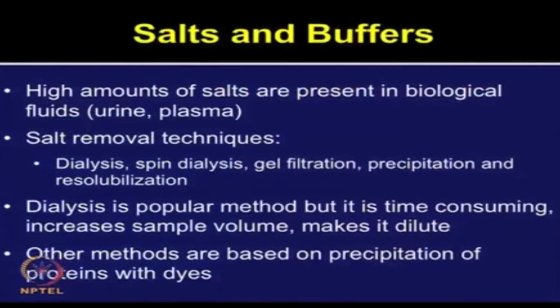There are other methods based on the precipitation of proteins with dyes. Those are also commonly used depending upon your proteomic application.